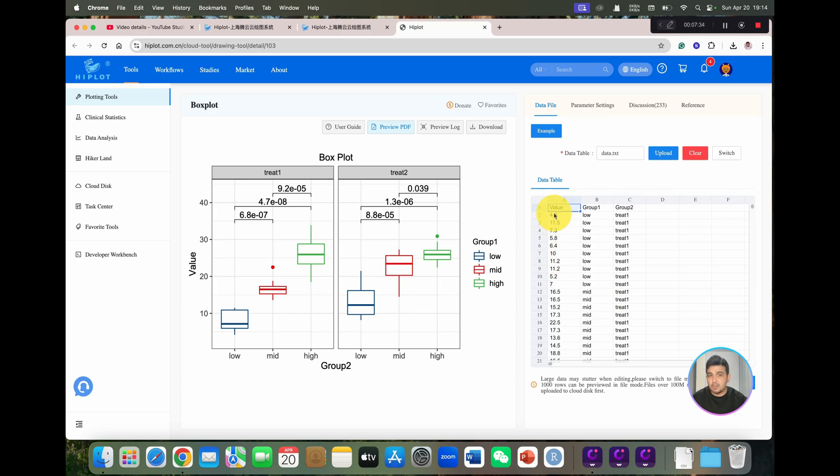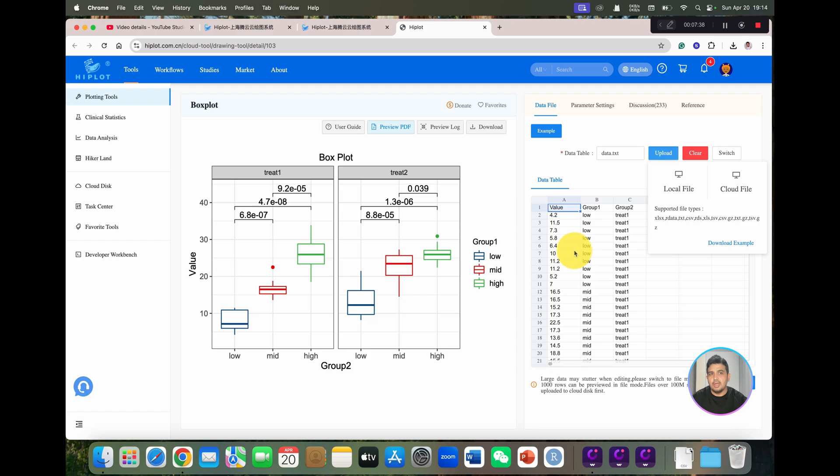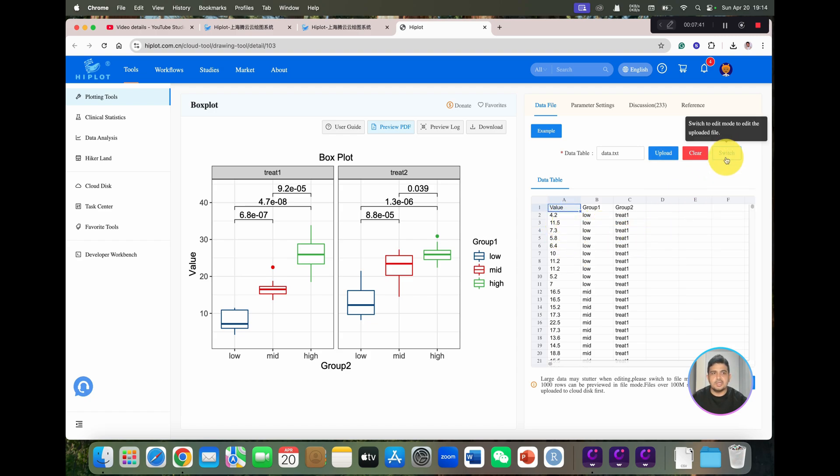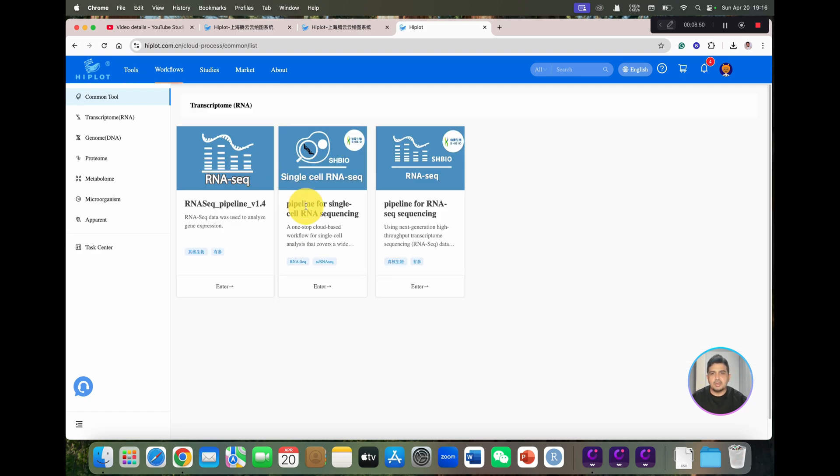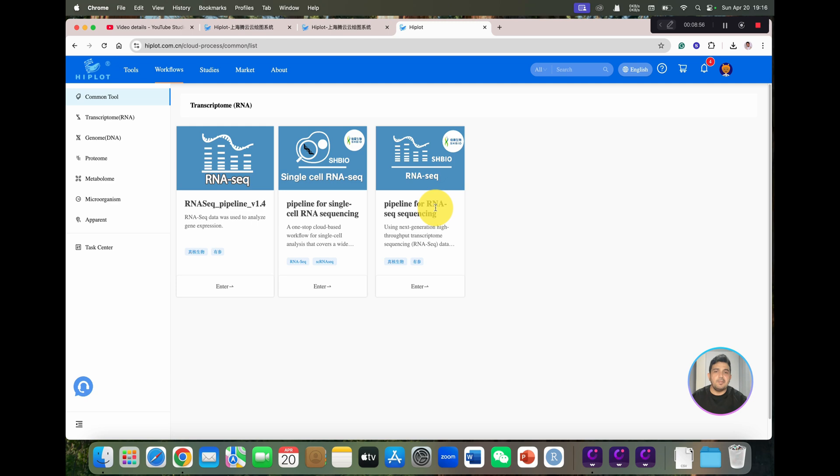If you want to edit and paste your data, although you have the option to upload your data as well, you can simply click on the switch. We have pipelines for single cell RNA-seq and similarly for RNA-seq sequencing as well.